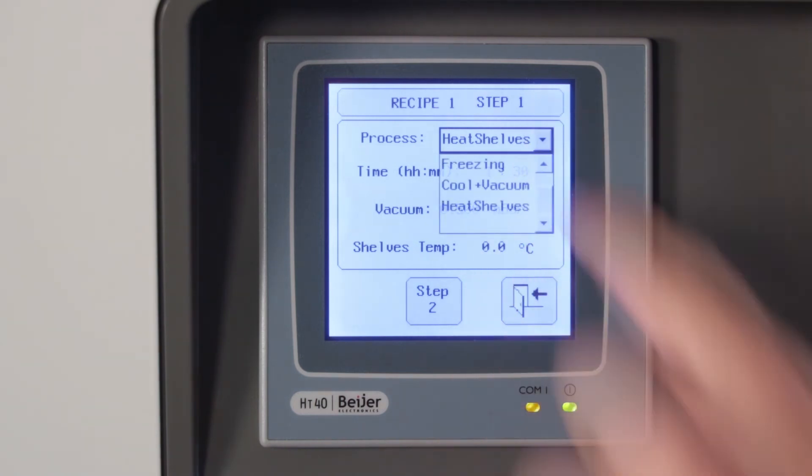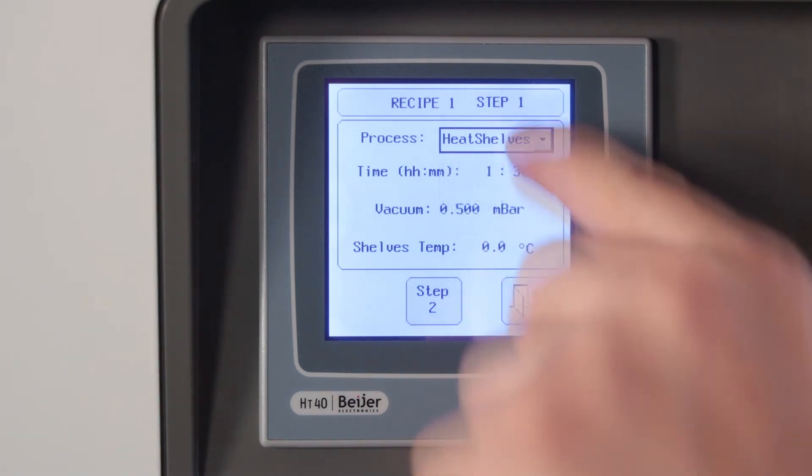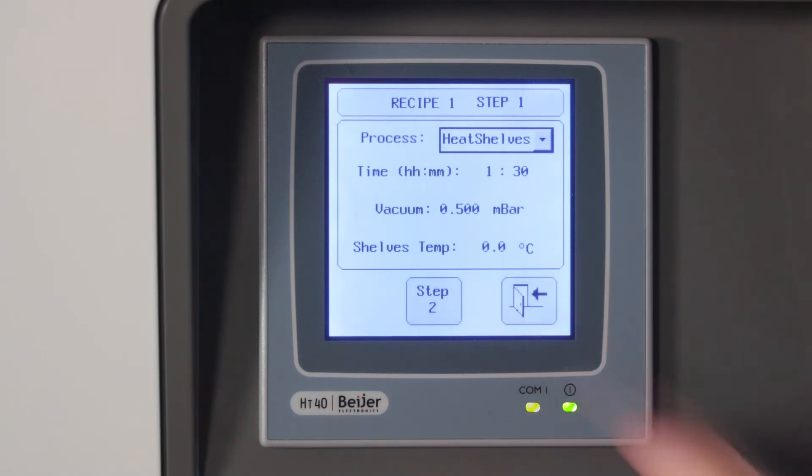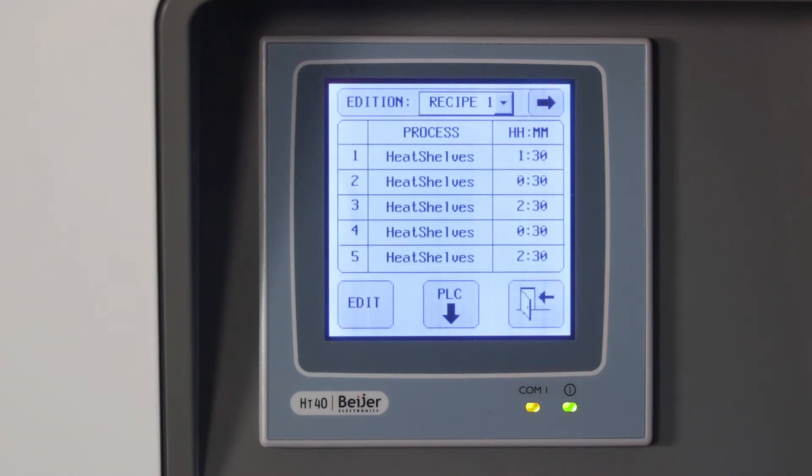In this screen, you can select the process and select the time, vacuum, and temperature set points. These recipes can be downloaded to the PLC.